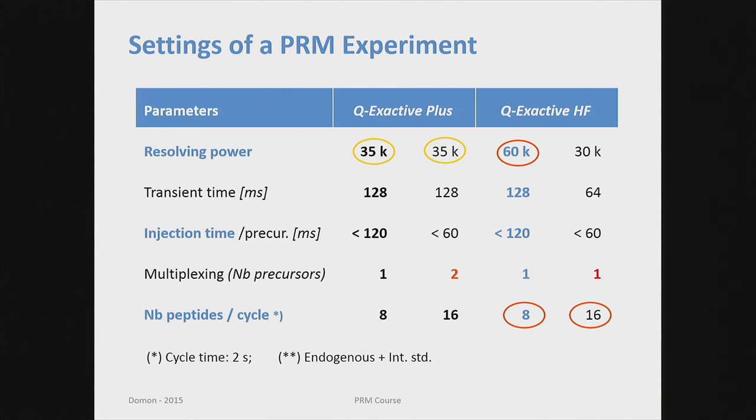The resolving power, resolution, and transient time are the same. It's not the same thing, but they go together. So this is the nominal resolution, that's the corresponding transient time. The fill time or injection time, we try to synchronize them to be most efficient.